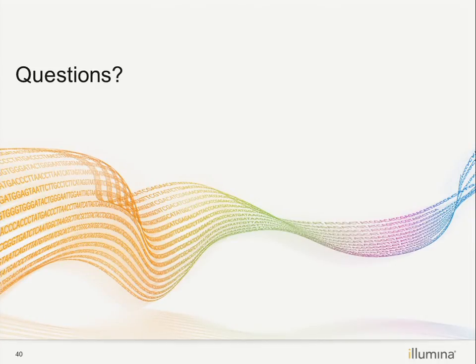So the clusters are not overlapped. You won't capture the top? No, they are not overlapped. Yeah. And you can tell. That's a very good question. If you have the thumbnail images stored, you will know. If, say, for an unknown reason it is out of focus, and you have the thumbnail image, you can tell. Say there is no image in the top surface, or something is out of focus, then you can tell all those differences.